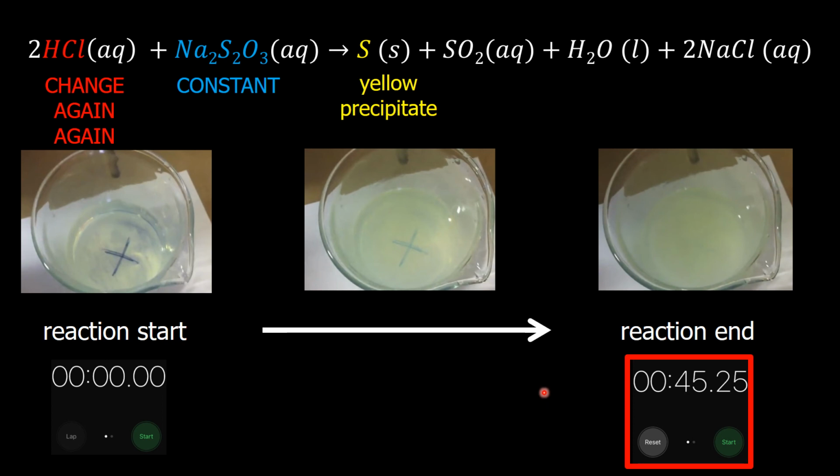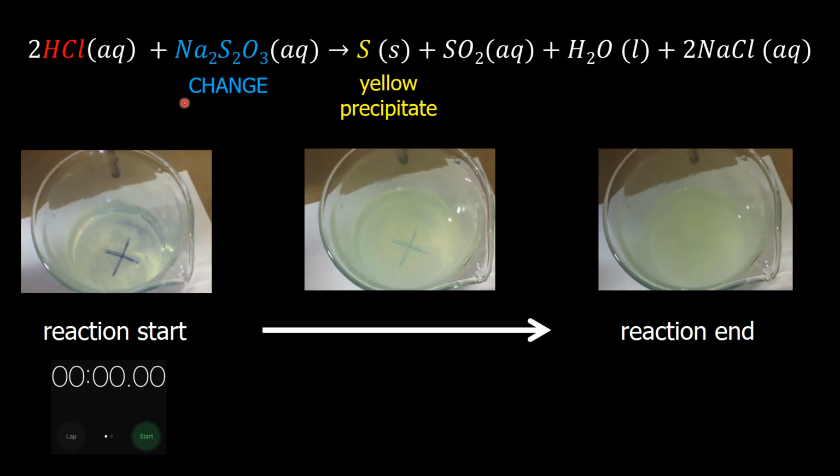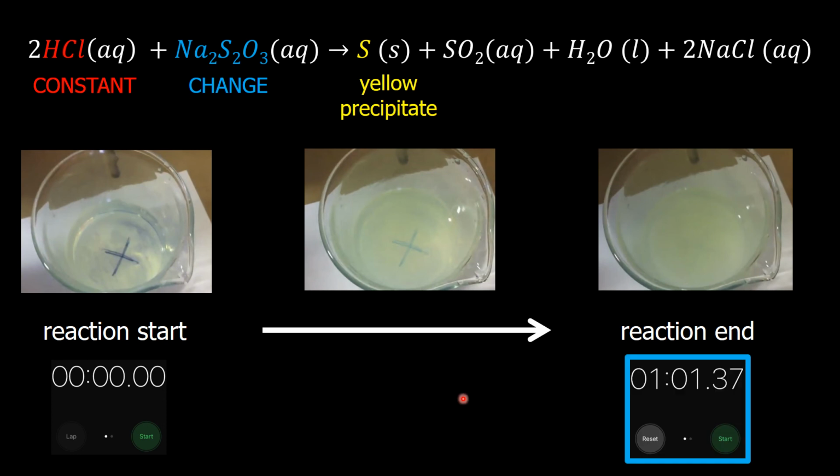After that, in order to see how the other reactant affects the rate, we're going to have to flip the situation around. So we're going to have to change the sodium thiosulfate and keep the hydrochloric acid constant, and then see how that affects the speed at which the reaction occurs.